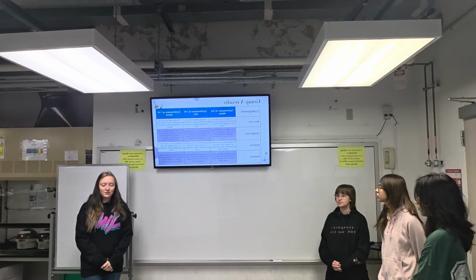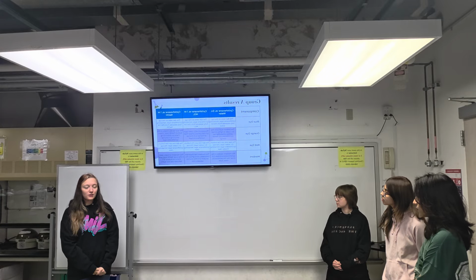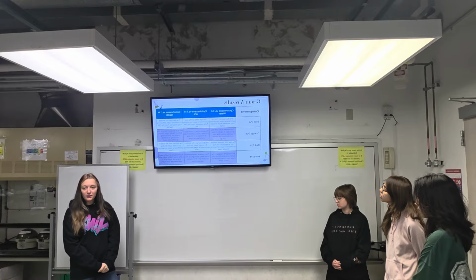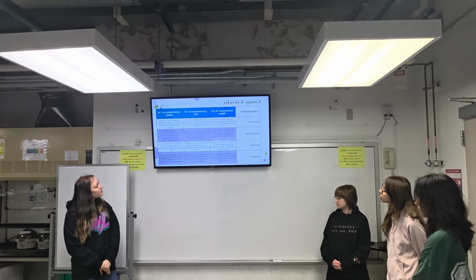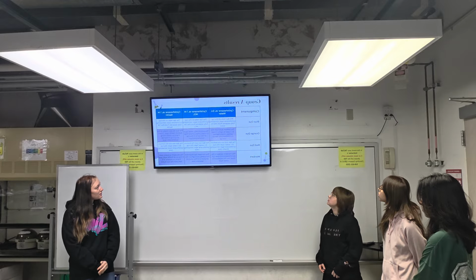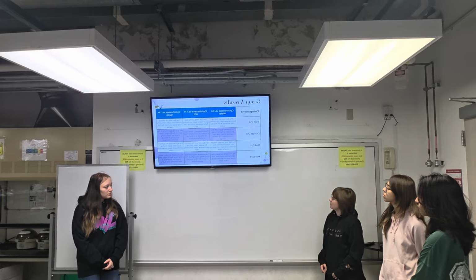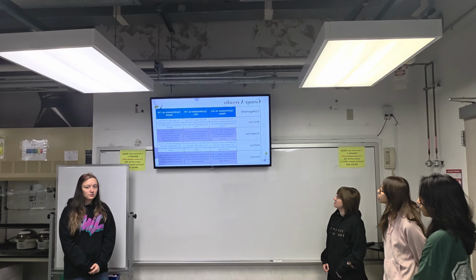So for results for group A, we found that throughout all the different versions for blue water, it rested on the top layer, which was the cyclohexane layer, and which remained fully separated from the DI water layer and the 1M HCl and 1M NaOH. So for orange, we found that there was a lot of mixing. There was some where the bottom layer was lightly tinted and some where the top layer was lightly tinted. But most of the dye was in the top cyclohexane layer.